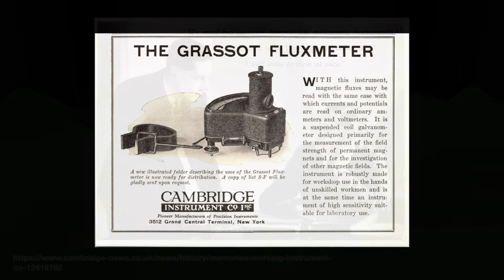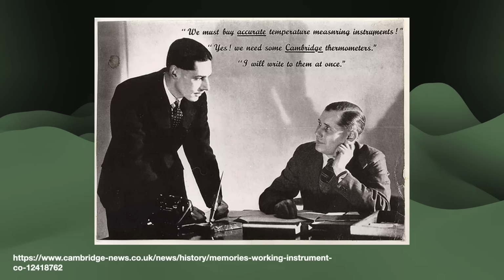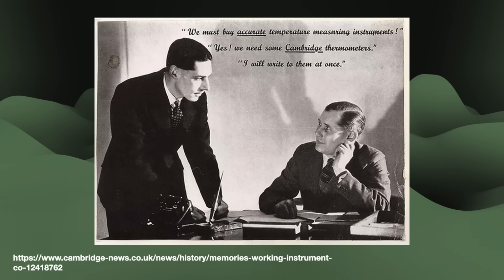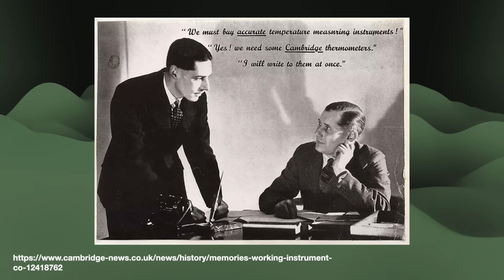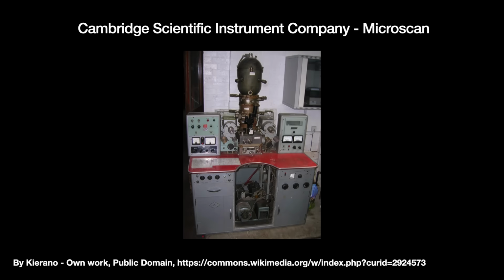By the late 1950s, the company had gotten to be in need of a little fresh blood, so they hired Harold Pritchard, an Oxford mathematician, to reboot R&D and get some new products out there. When meeting Oatley, Pritchard had actually been interested in a different product. That was the Microscan, which today we call the electron microprobe. It fires an electron beam at a sample in such a way that causes them to emit X-rays, which the instrument reads.